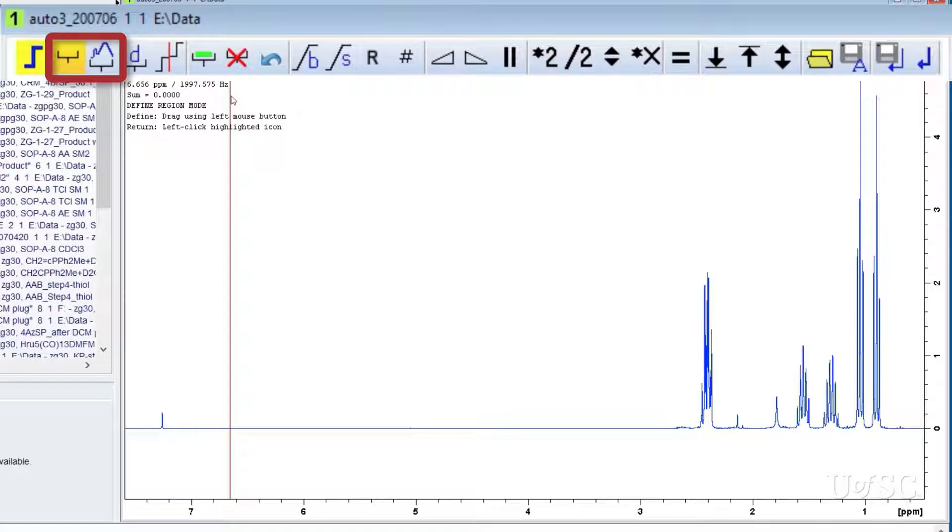The difference between these two is that the plain bracket is used when your peaks are all separated from other peaks and the baseline is flat going into and out of the peaks. The wavy line icon does a local baseline correction and is better to use when you are trying to integrate peaks that are near other peaks.